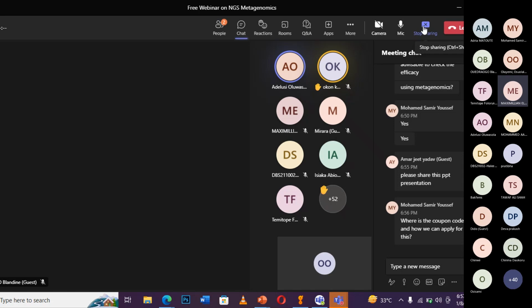I think you have to do culturing. Hello, are you with me? Yes. Let me try to explain better. For whole genome sequencing, let's assume I want to do it for a particular fungi species.